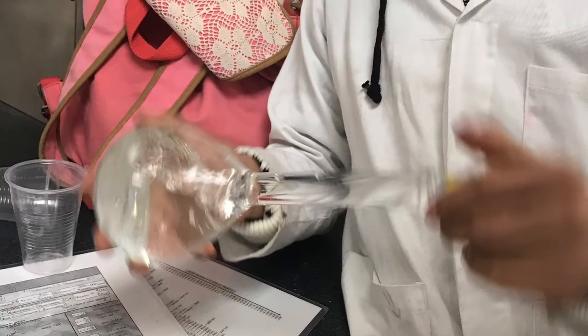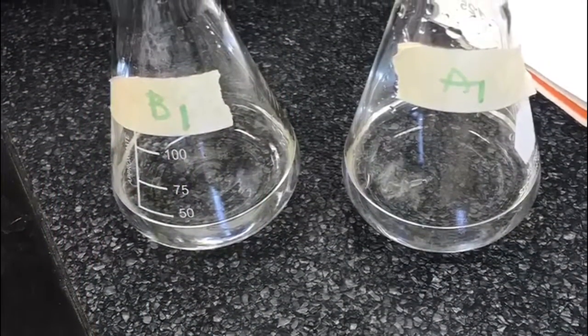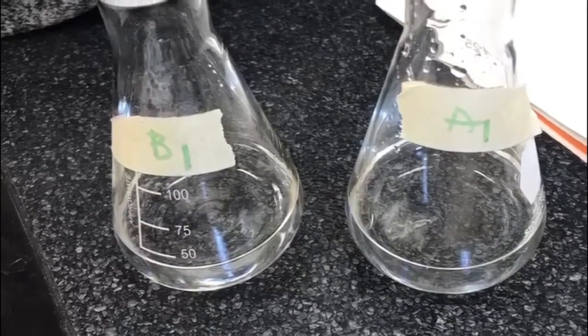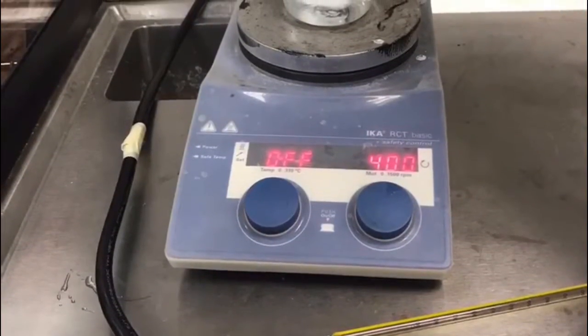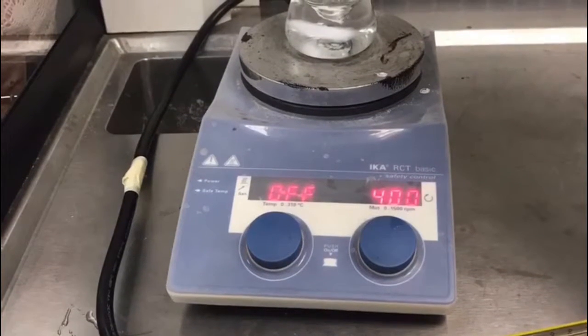What we did in this practice was to prove the influence of the concentration of the reactives on the reaction speed, and we could get the initial reaction speed and the partial of each element. In this practice, we made different experiments with different reactants each time, and each time we changed the concentration of each reactant, and also on each experiment we changed the temperature.